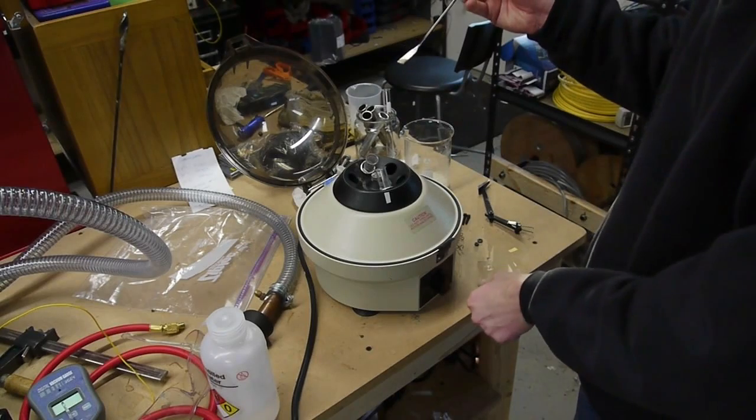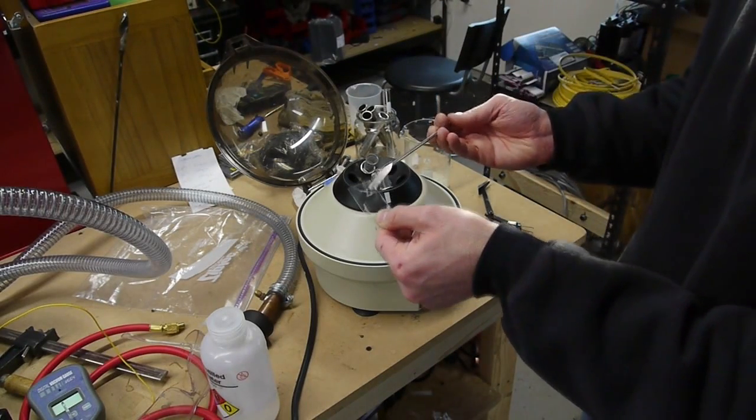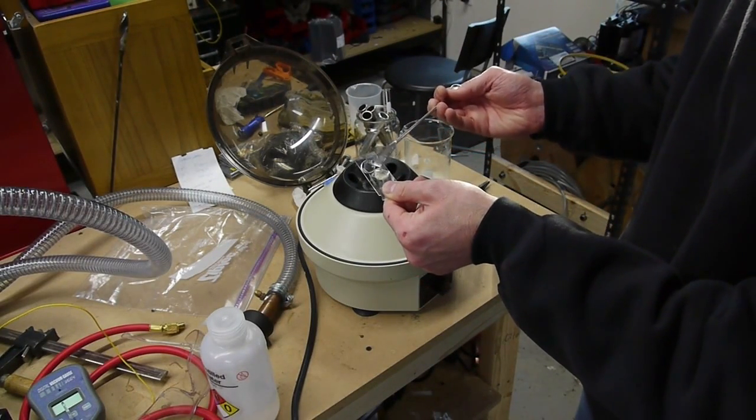I'm not sure of the exact magnification. It would probably be better to look up the size of bread maker's yeast cells on the internet and use that as a reference rather than try to figure out the magnification. The objective is 40x, but you have to take into account the distance between the objective and the camera since I'm not using an eyepiece to show this video.